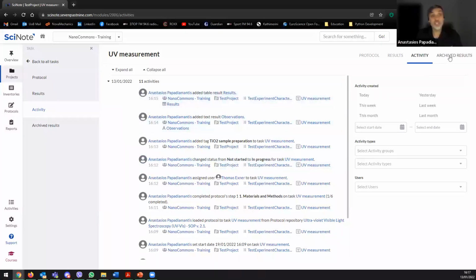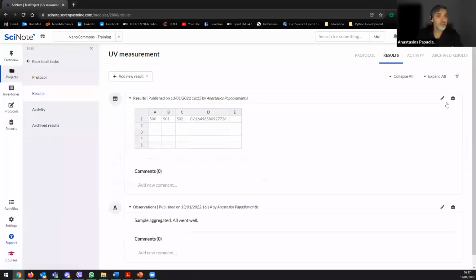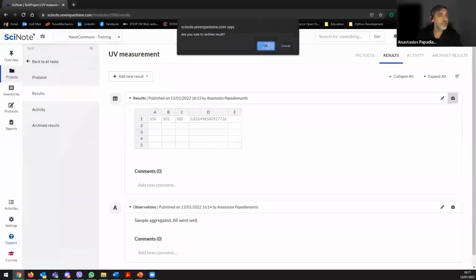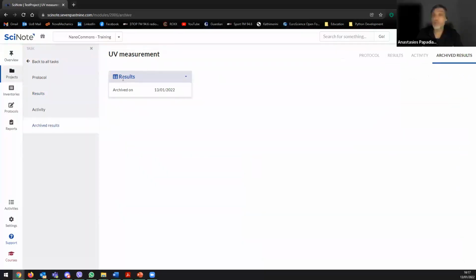And in case you have deleted something, you would see it here. So if I went and archived this table, it would go away from my results, but it will still be here and accessible and can be retrieved or checked by the people that are responsible for QA, QC purposes, and so on.